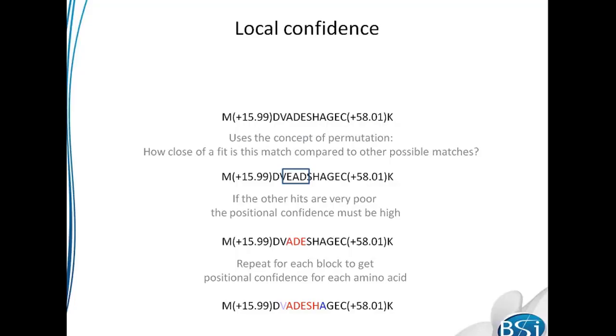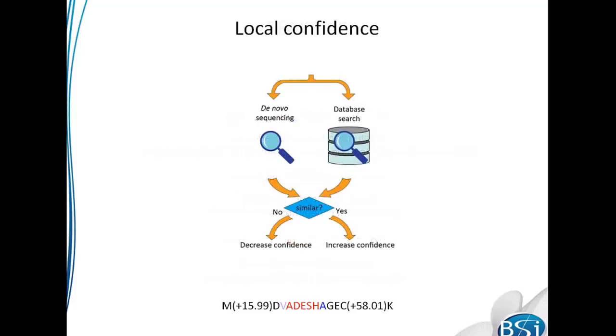All right, so yeah, just going back to the slides. So that's de novo sequencing. Moving on to the other parts of PEAKS when we actually infer proteins from that information. So let's talk a little bit about PEAKS-DB, which is our protein identification search. So this figure here shows you the concept of PEAKS-DB.